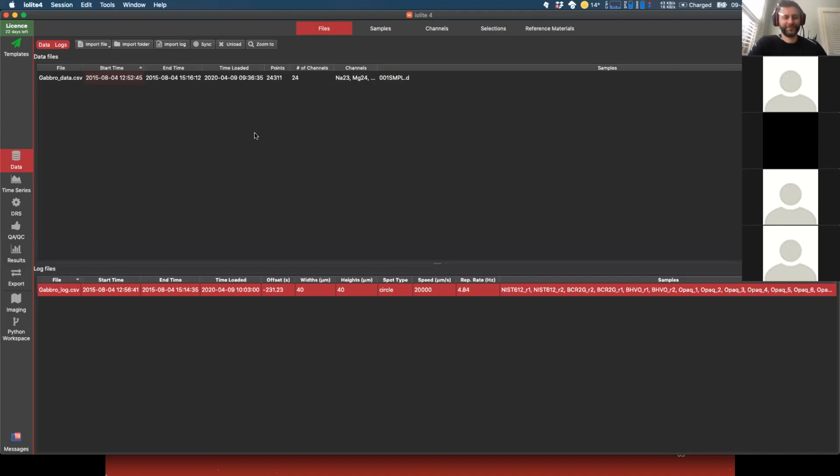Okay, so I should not open it in Excel, just save it without opening it. Yeah, exactly. Or if you do want to look at it, you can open it in other programs, like Notepad or TextPad, I think it's called as well, and they won't automatically change the values for you. Okay, I will do that then. Thank you. That's a good question.